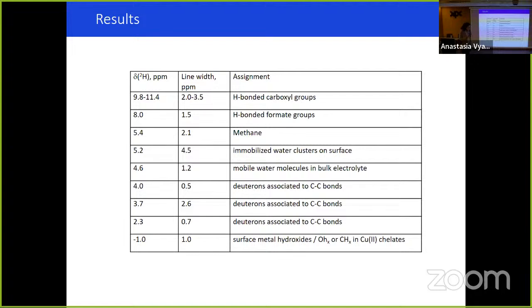The first question was about how we can distinguish interface signals from others. We know the structure of the inorganic component, which is pure fluorapatite, because we also have X-ray evidence and EDX measurements.